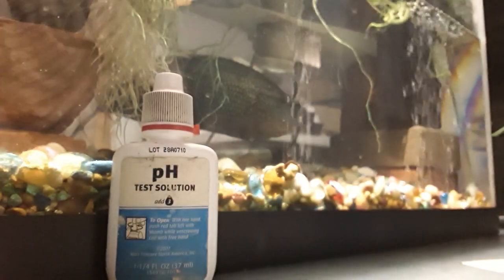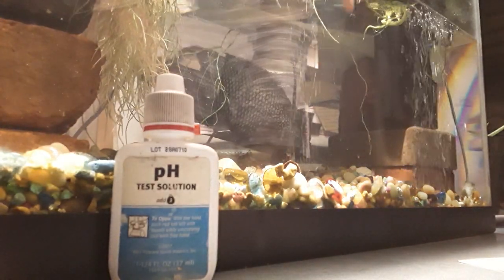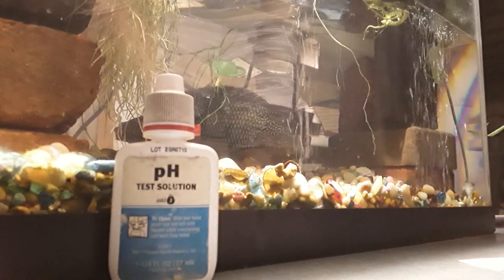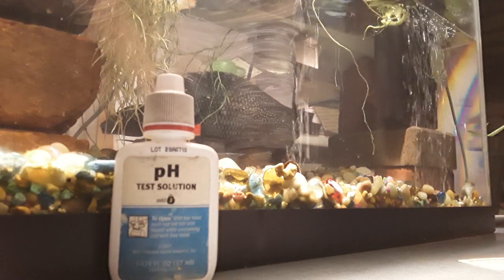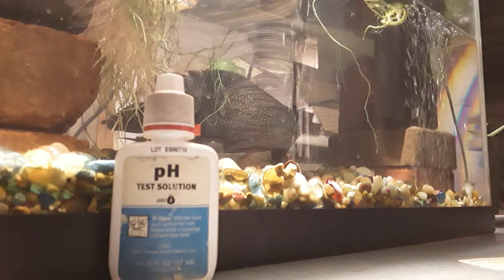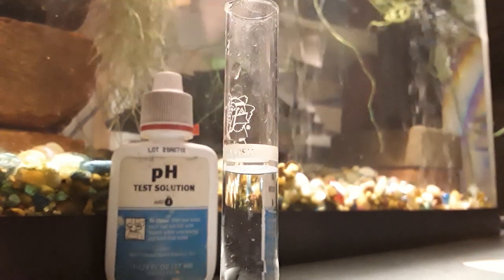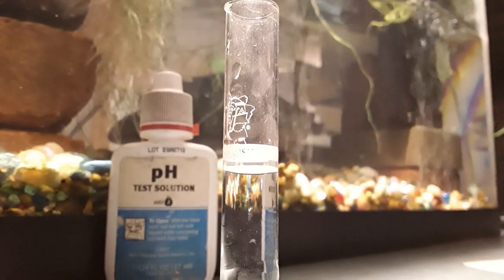I got my clean test tube right here. I'm going to go in the aquarium, filling it up, emptying it, filling it up again, emptying it. What I'm doing is making sure I just get aquarium water in there. I don't want any of the tap water I just cleaned it out with affecting my results — it will be more accurate this way. What I just did is fill it up to the line. Now I'm going to take the test tube cap, which will also be cleaned out in the aquarium water to make sure it doesn't affect the test.